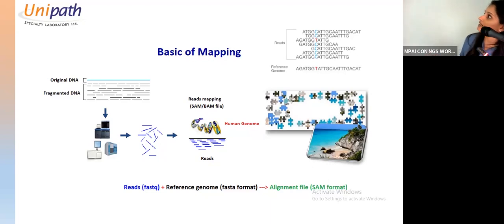But as you can see here, in the reference it was T, but in this particular sample it is C. In one of the sequences it is T, and again it is C. So it is a mutation. Heterozygous or homozygous, that again depends on the reads.